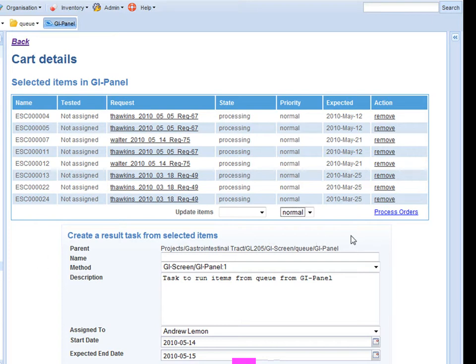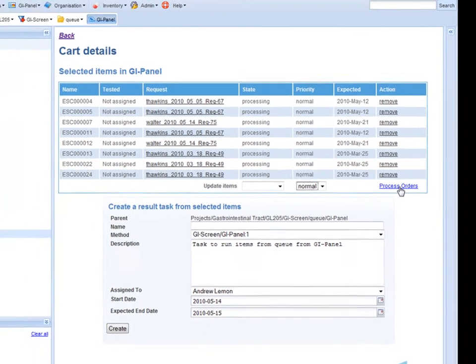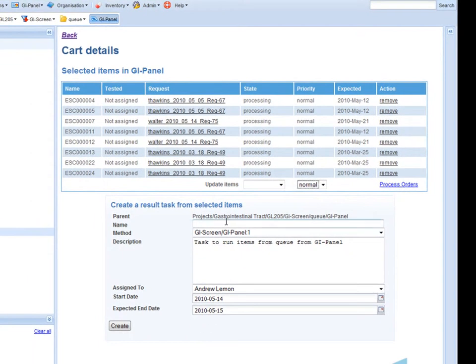I can either wait for that to happen asynchronously or I can press the process orders button and have it done immediately. Once the stock arrives I will then add in an experiment name.